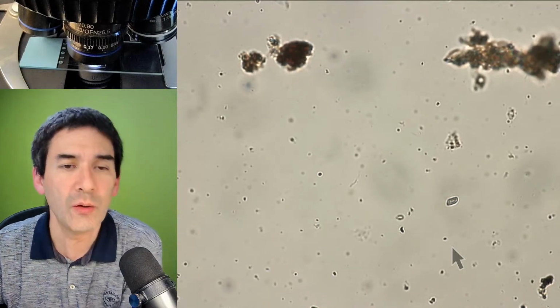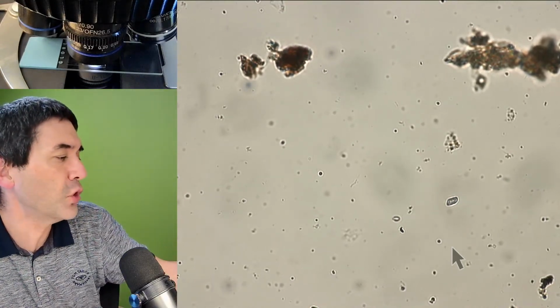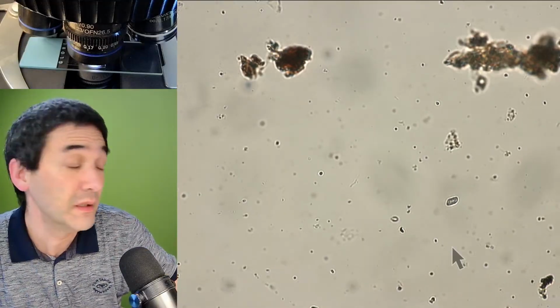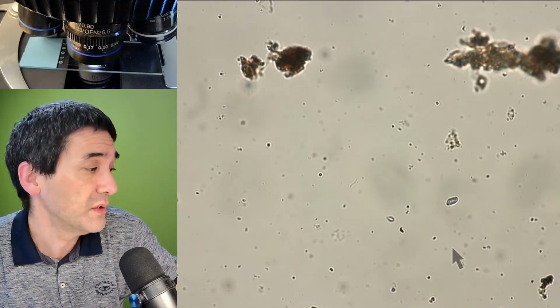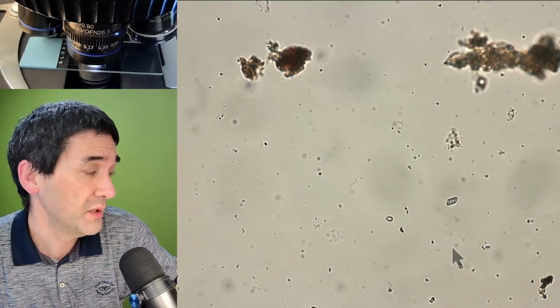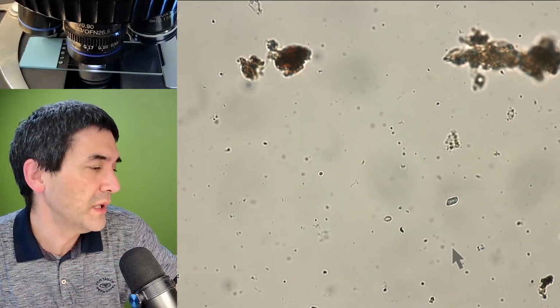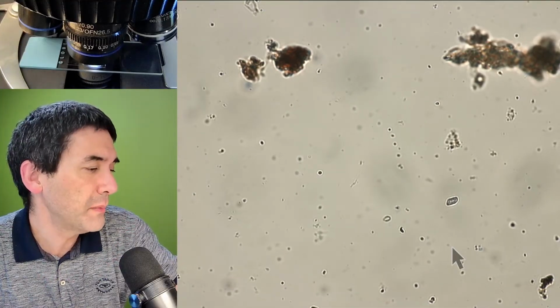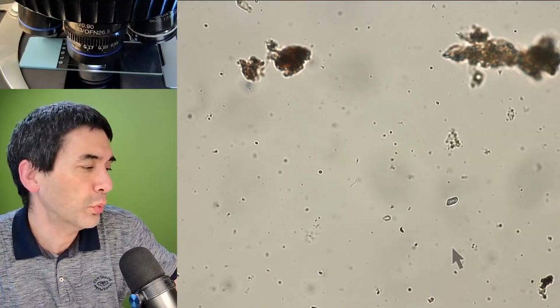So the next question is: does it need a special microscope? And I'm saying, well, ideally, if you want to see bacteria, you probably want to use phase contrast, or, as we said, do some staining. And the last question is the following: it's a huge topic, and I'm a beginner. Would you explain what to look for in a rich, healthy soil compared to poor, unhealthy soil?